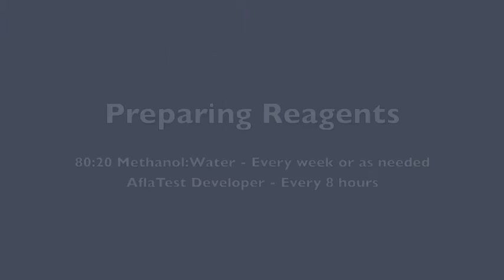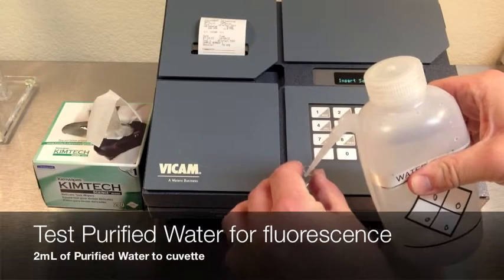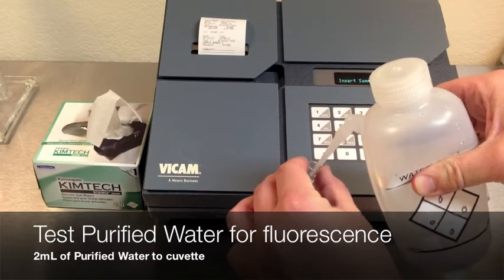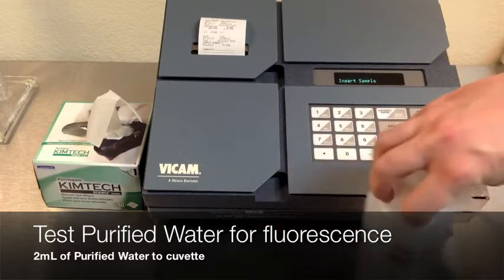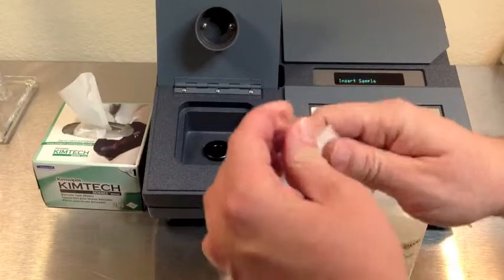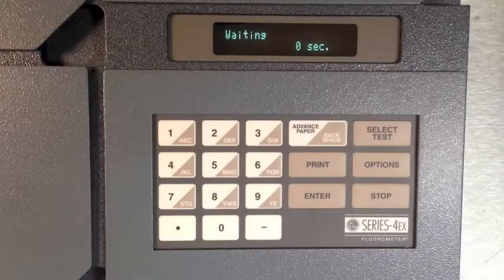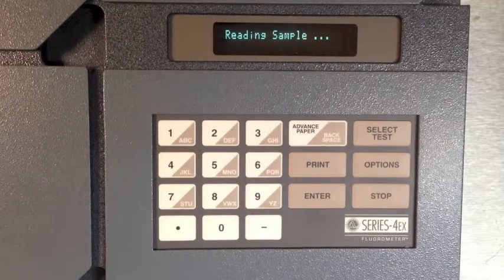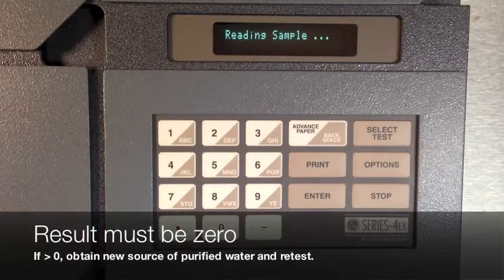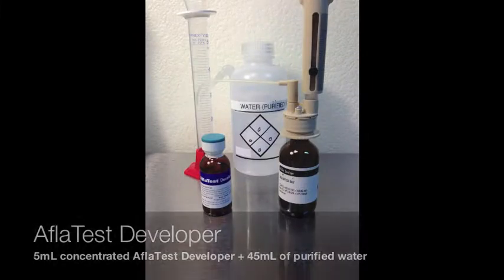This test requires 80/20 methanol water and Afla Test Developer. We will first test your purified water for fluorescence. Put two milliliters of water into a clean cuvette and insert into the fluorometer. After 60 seconds you will receive an answer. Your number must be zero. If not, obtain a new source of purified water and retest.